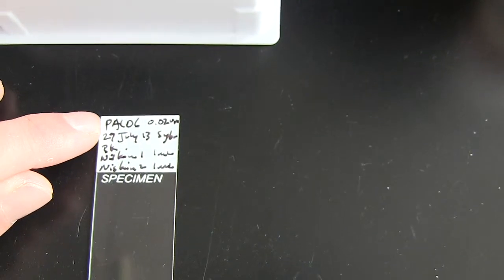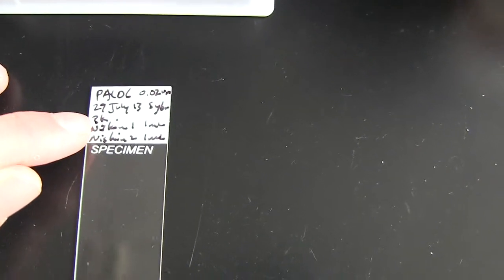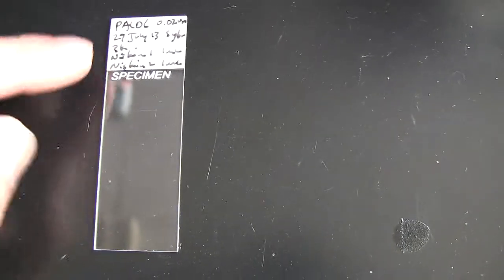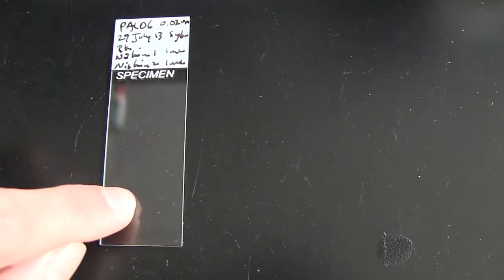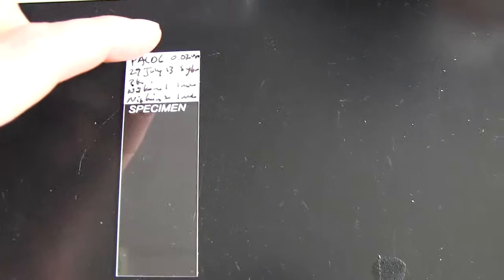Now on this slide you'll see that we've got the consistent and usual, the site, Palo 6, we have a date, we have the person who took the sample, as well as Niskins. Usually when you make a slide, you'll actually take, for example, all the SYBR filters from a given site, and you'll put them Niskin 1, Niskin 2 on a slide. That way we can put all the SYBR slides from a site into one slide box and all the DAPI slides in another.